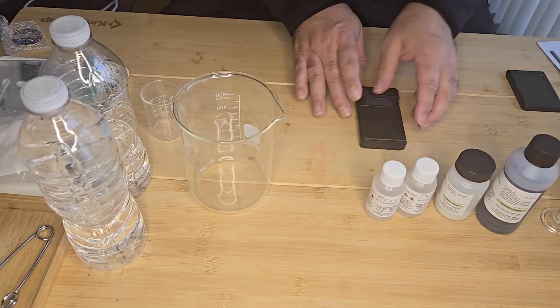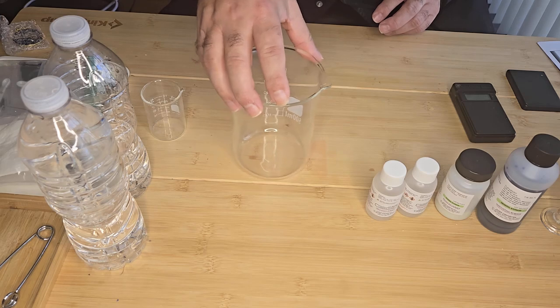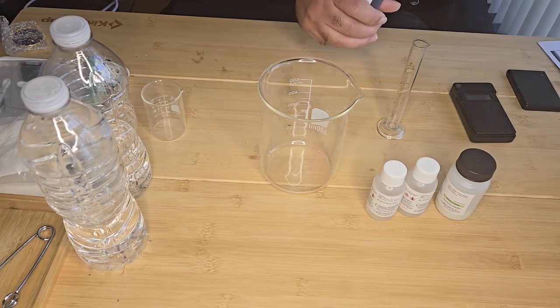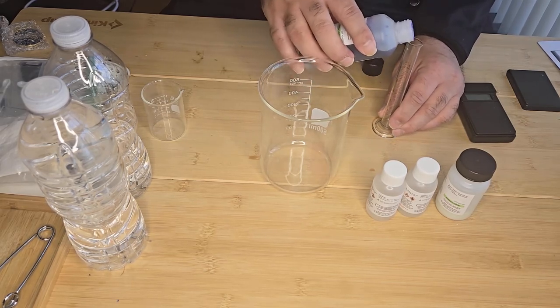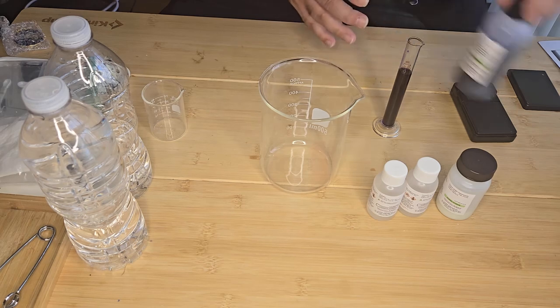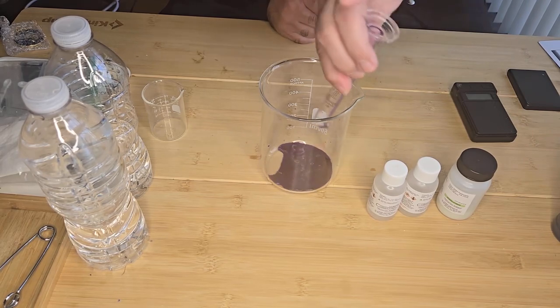So what I'm going to do in a 500 ml beaker, I'm going to add 10 ml of the thionin solution. I'm just going to pour that in. Okay, so 10 mils. It doesn't have to be accurate. And I'm going to put that into the beaker, like so.